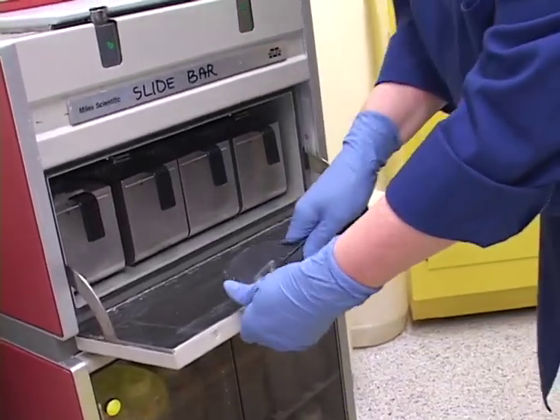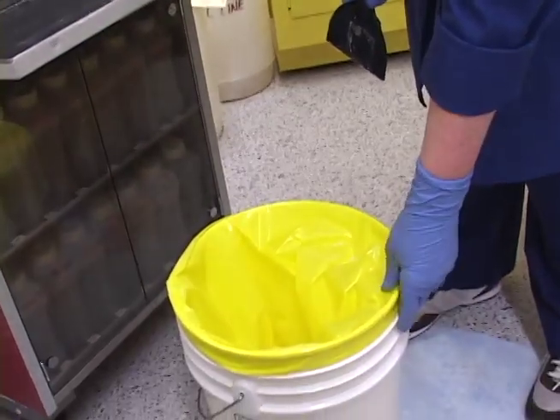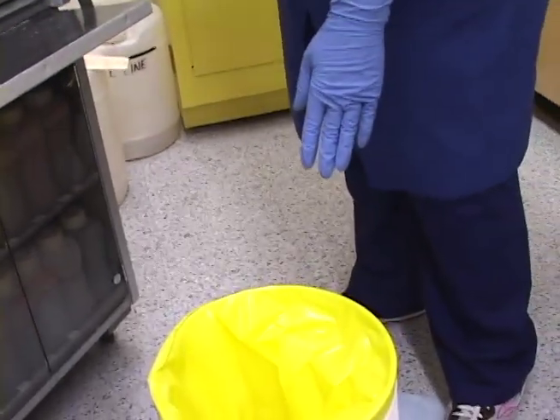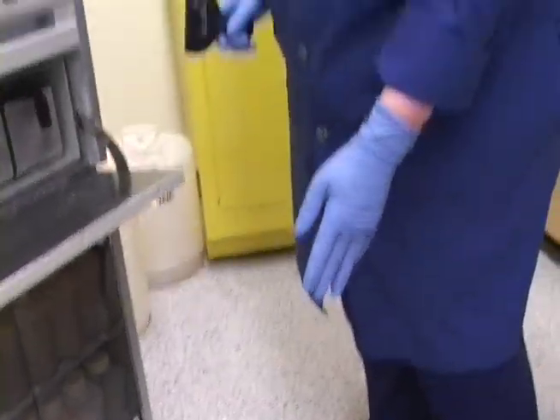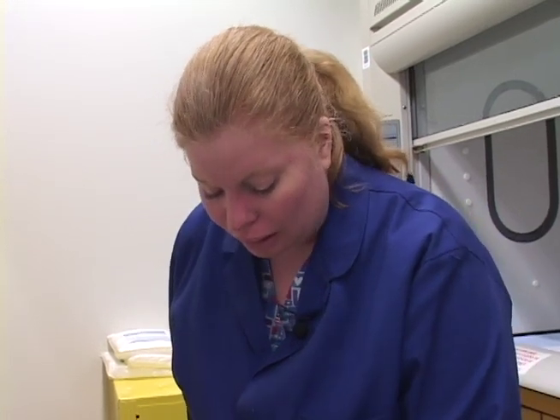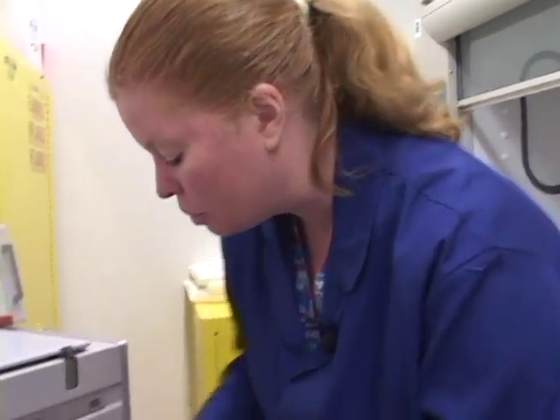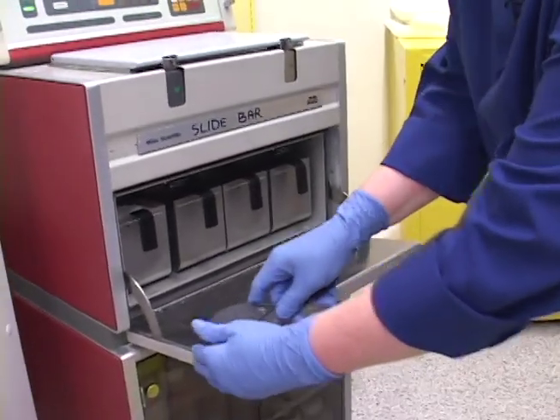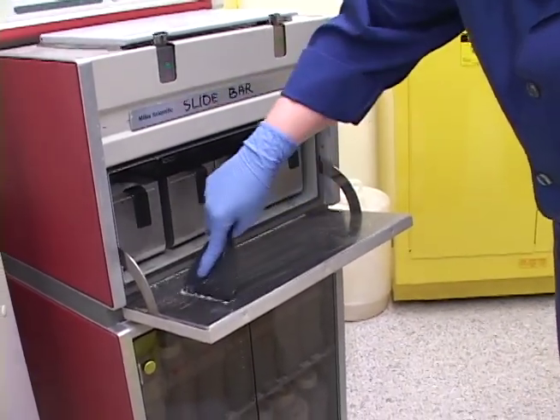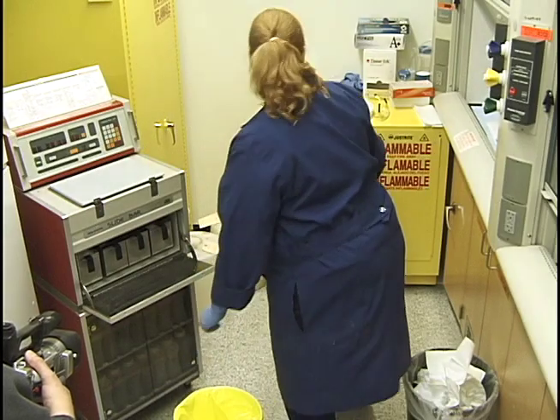This waste paraffin going into the bag — you don't want to overfill it. I only fill it about three quarters full, and it can actually be put in regular trash. So I write 'regular trash' on it and set it out for the cleaning people to throw away. The xylene kind of evaporates out of it, so it's really fine to do that.